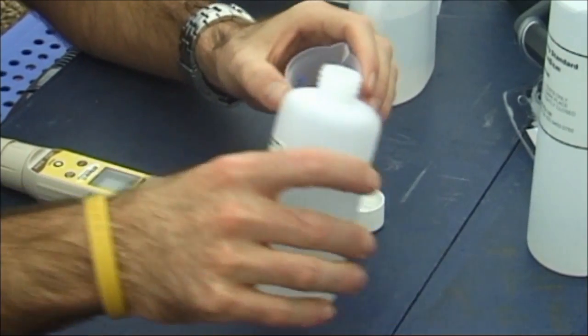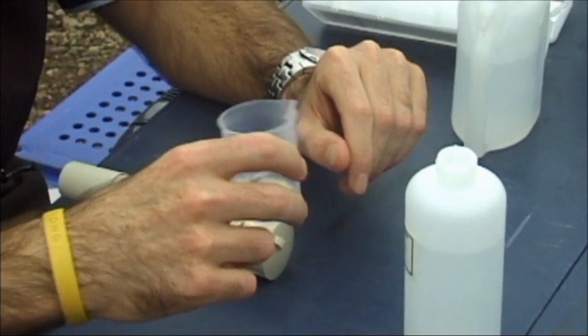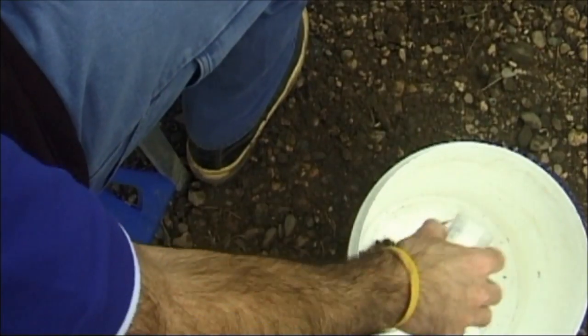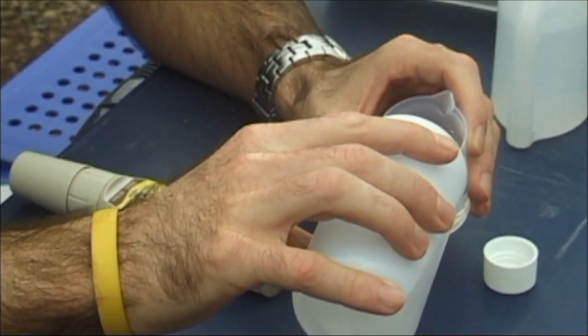Rinse a container at least twice with the calibration solution. Pour calibration solution into a container to a depth of 3 cm.